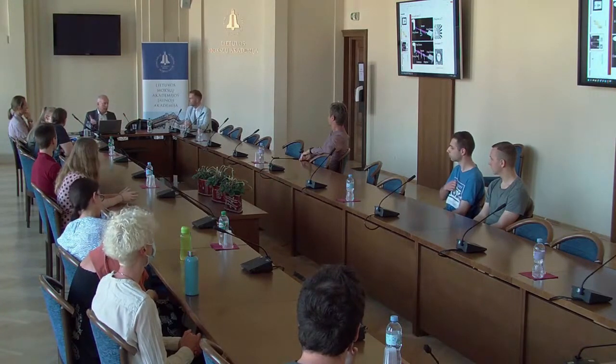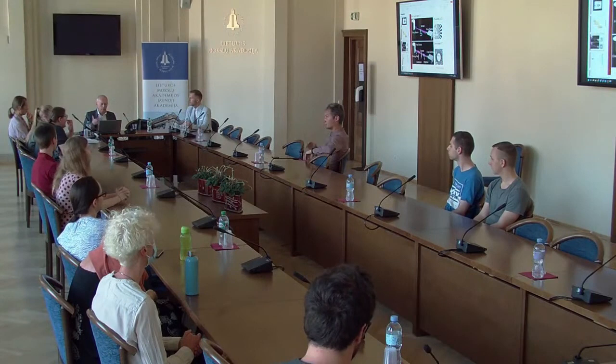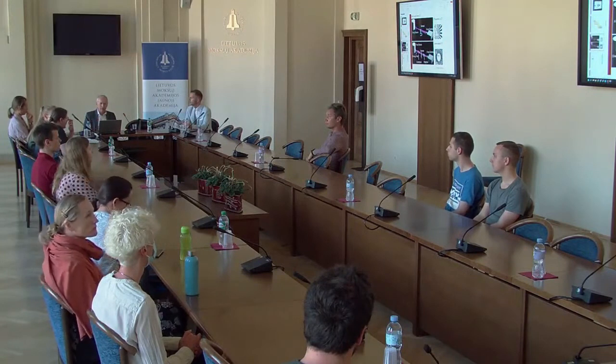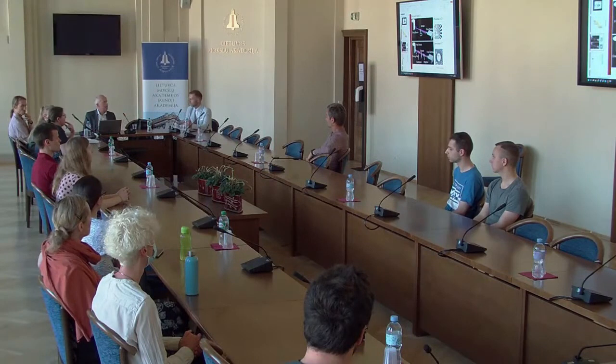Taip pat detektoriai. Jų efficiency galėtų didėti ir daugiau to rentgeno fotonų surinkti. Tas signalo ir triukšmo santykis gerėja. Ir jo, daugiausia ten vyksta.